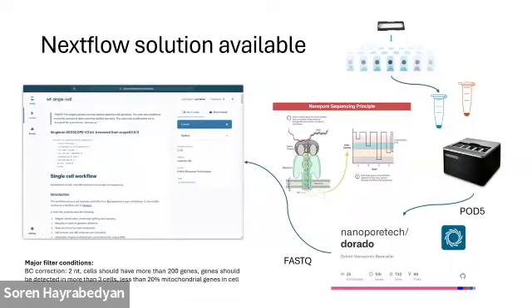These UMIs are very important because in single cell sequencing, you don't have expression like in bulk sequencing, you have counts. And you analyze counts by counting the UMIs in each cell. So if all barcodes are equal, then you have one cell. And then the algorithm calculates how many UMIs you have. If they're similar, then all is pooled together. These are pieces from one single RNA. If you have multiple same-type RNAs with different UMIs, then you have several molecules.